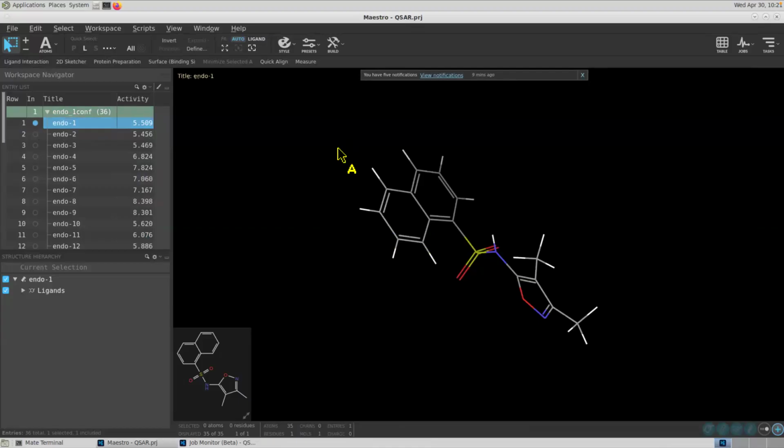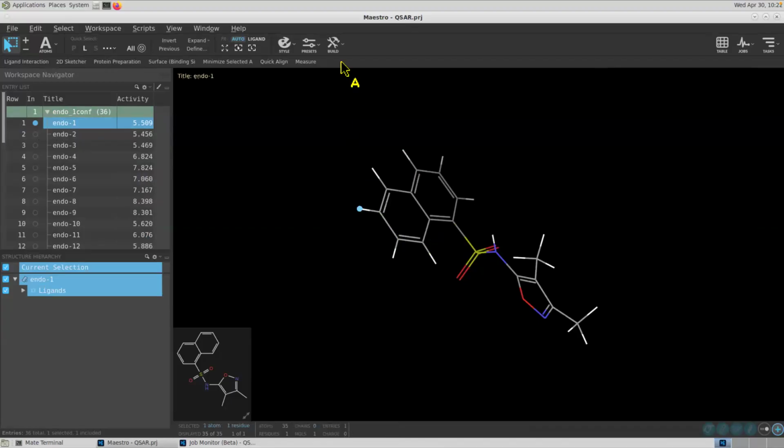Like yesterday, you have seen this enumeration. I'll do that one very quickly. So I'll just randomly select this hydrogen part of my ligand. If you are not able to do this, I'll again repeat, don't worry.